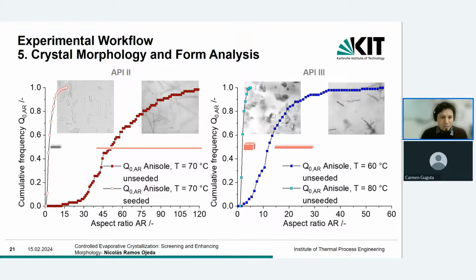It was an efficient selection of solvents, and we exploit the capability of the evaporation so we can perform experiments at very high temperatures. And all those are features that we would like to highlight from our workflow.